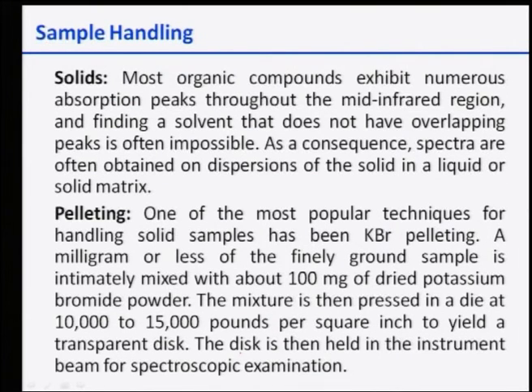Well, I have already told you how to use liquids. Let us talk about how to use solids. Most organic compounds exhibit numerous absorption peaks in the mid-infrared region, so finding a solvent that doesn't overlap these peaks is impossible. As a consequence, spectra are obtained on dispersions of the solids in a liquid or solid matrix.